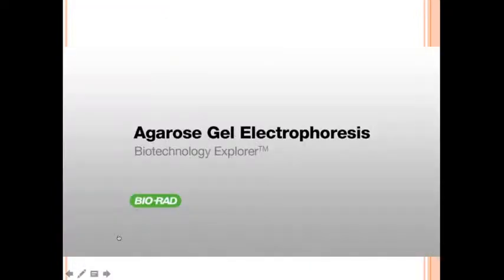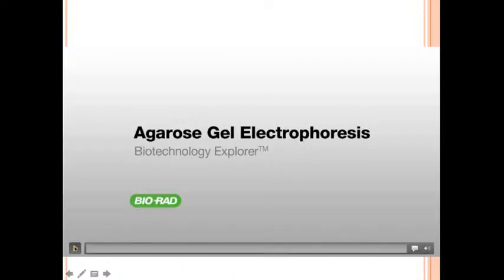So, gel electrophoresis, a short review.